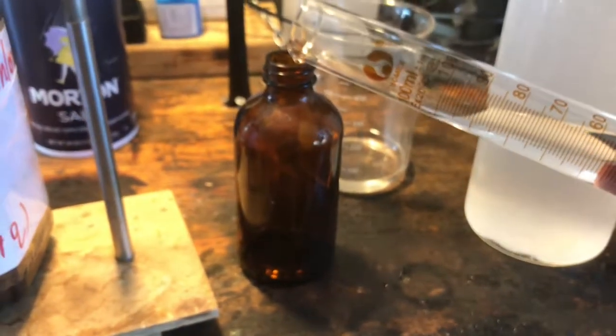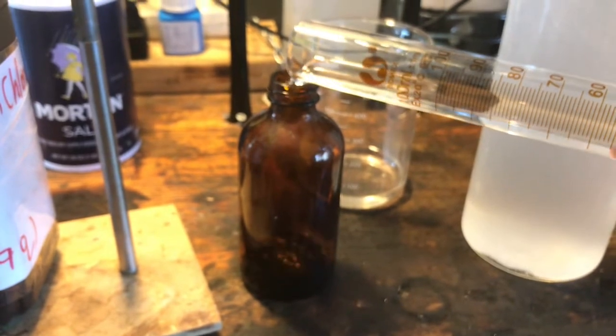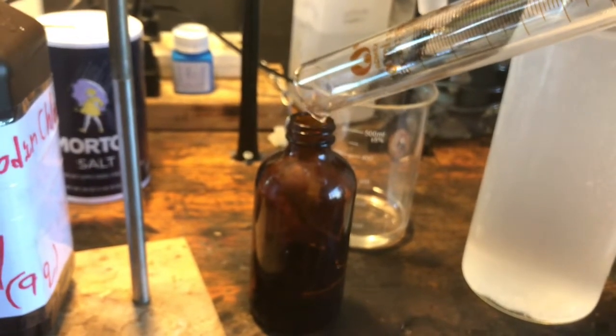It might be worth distilling, because it might contain ethyl benzene contamination. I'm not sure if you can separate that by fractional distillation, but I don't know — I haven't tried it, because I don't have a small enough flask for this.